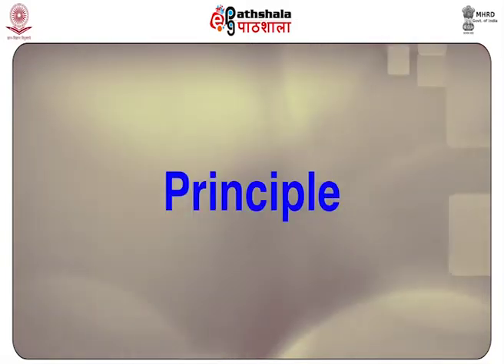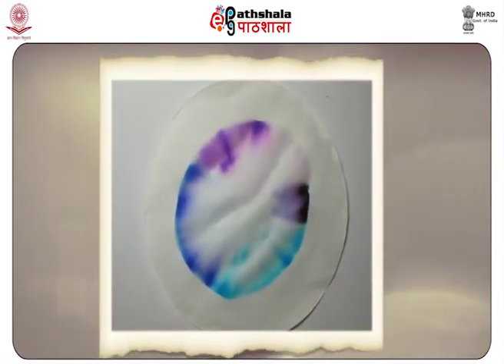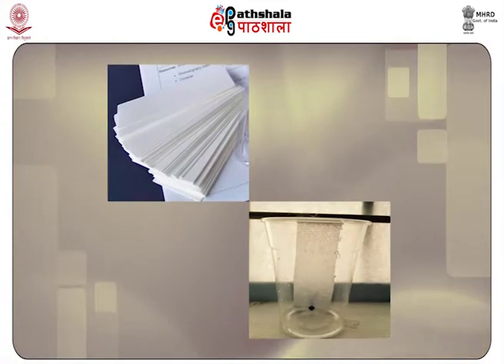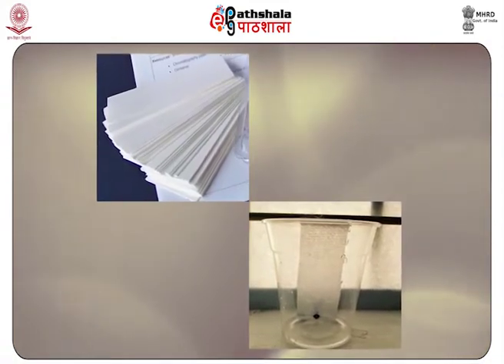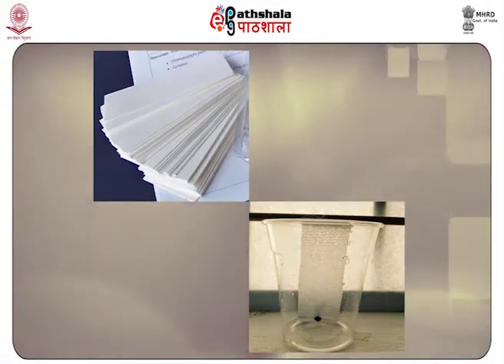Principle. The principle involved in paper chromatography is similar to that involved in other chromatographic techniques. Here, the stationary phase is a high quality paper and the developing solvent works as the mobile phase that migrates through this stationary phase, carrying the samples to be analyzed with it.